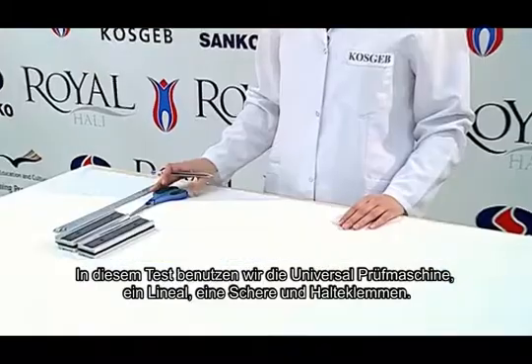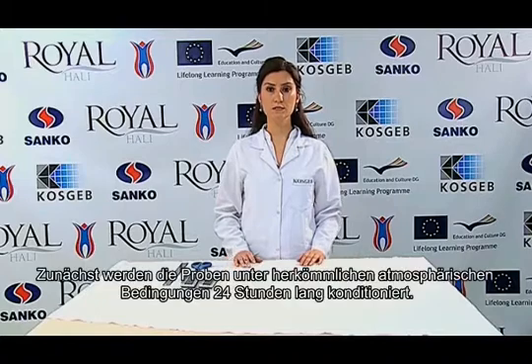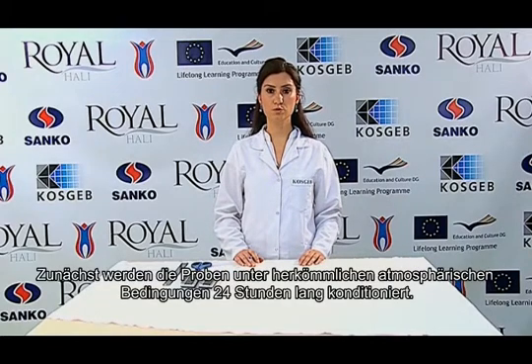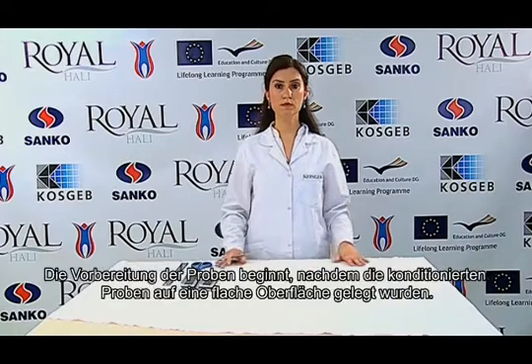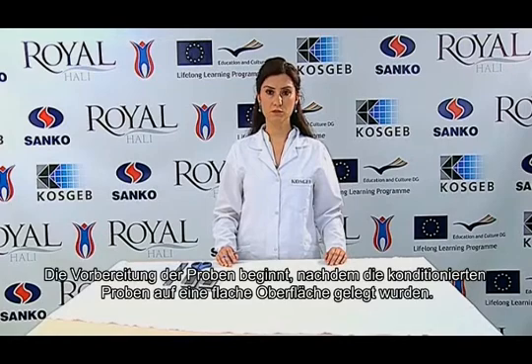We use the universal testing device, a ruler, scissors, and holder jaws in this test. First of all, the samples are conditioned under standard atmospheric conditions for 24 hours. Laying the conditioned samples on a flat surface, we start sample preparation procedures.